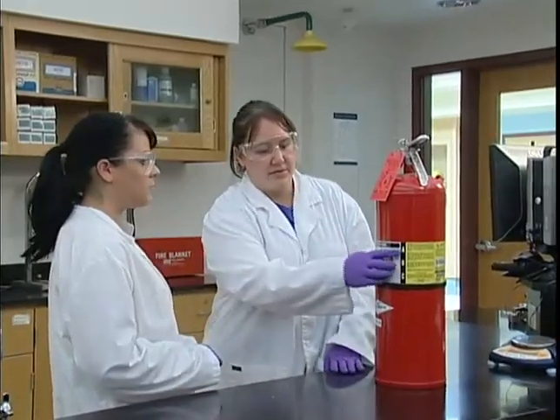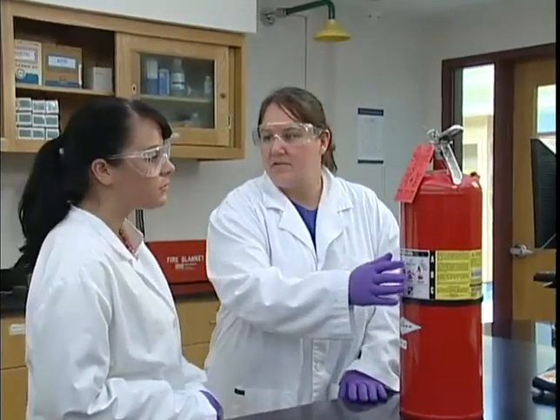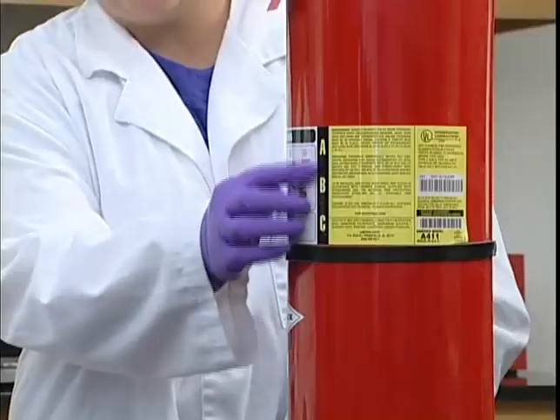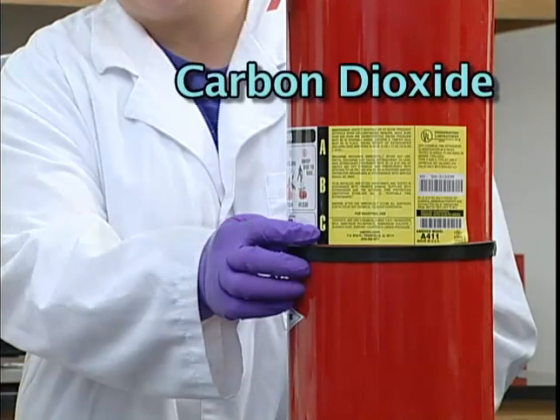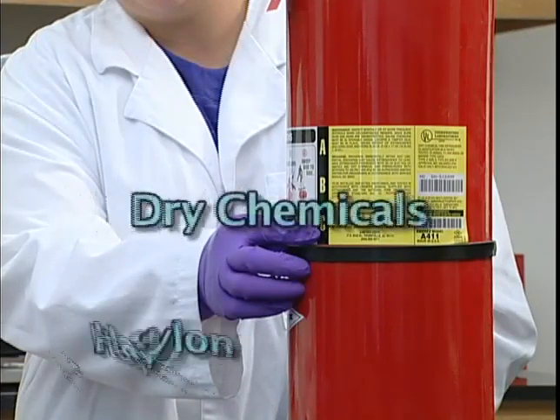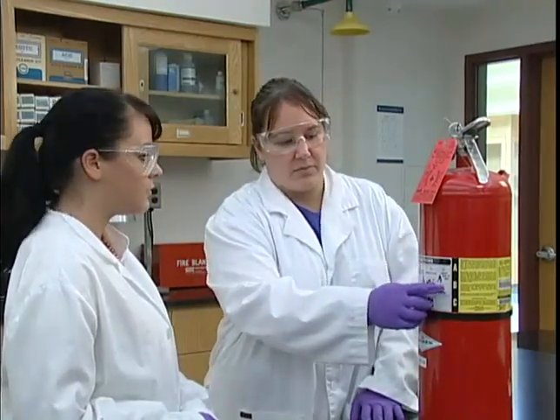Appropriate extinguishing media to use when fighting a fire involving the chemical is also identified in this section. These may include water, water fog, foam, carbon dioxide, halon, and other dry chemicals. Using the wrong type could make a bad situation even worse.